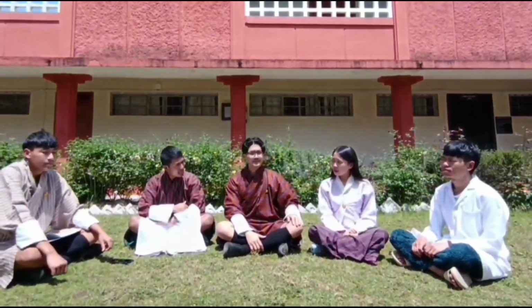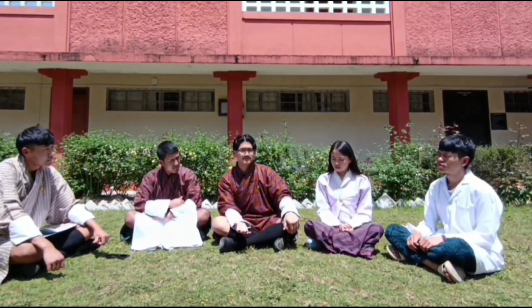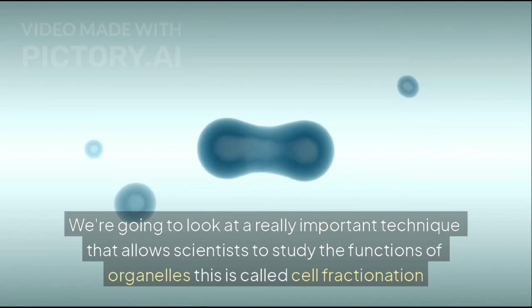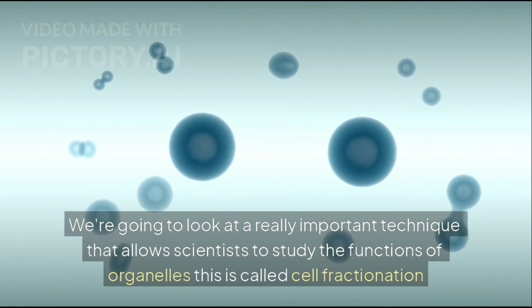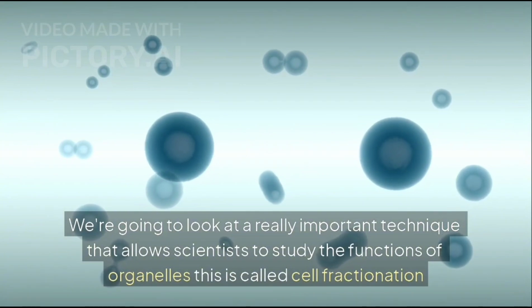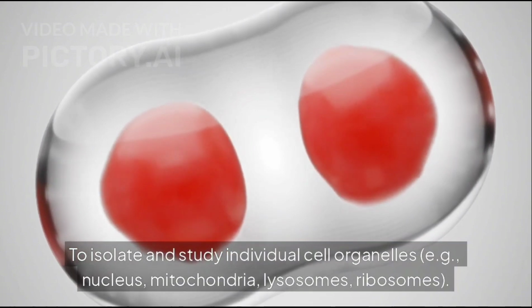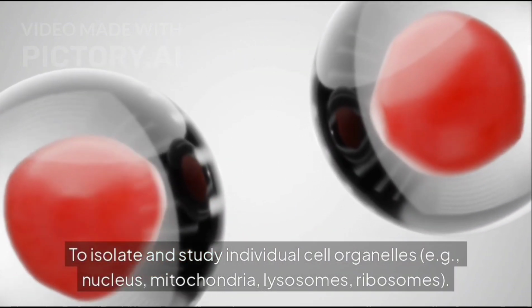So today we're going to talk about what cell fractionation is and what the various steps involved in the process are. Today we're going to look at a very important technique that allows scientists to study the function of organelles, called cell fractionation. Purpose: to isolate and study individual cell organelles, for example, nucleus, mitochondria, lysosomes, and ribosomes.